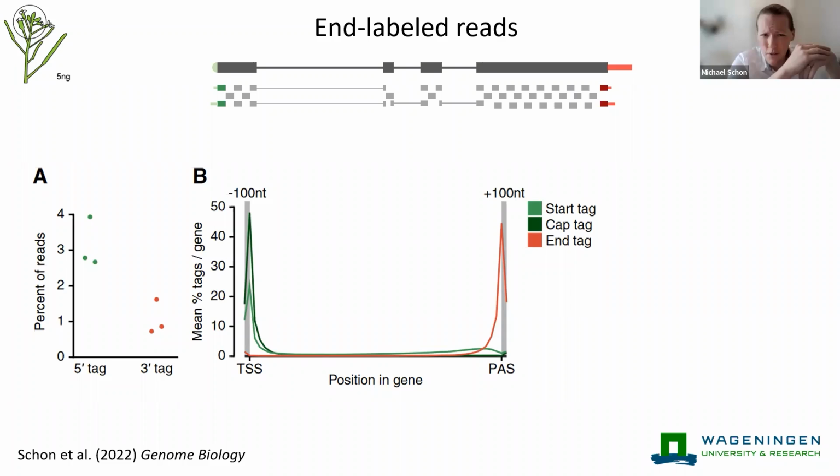However, RNA is very fragile, and it quickly degrades both in vivo and in vitro. And one persistent problem in transcript assembly is RNA degradation, where you'll have a very dense representation of RNA at the 3' end, but as you go toward the 5' end of the gene, coverage drops lower and lower and lower.